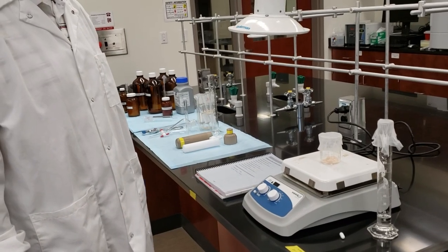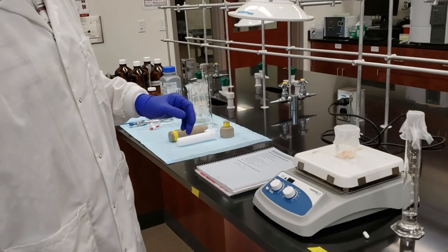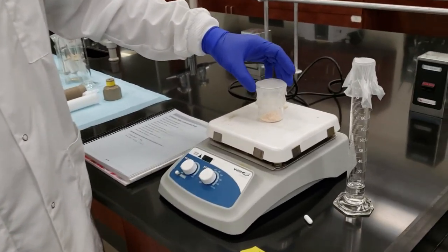CHEM 2212. This is the Williamson ether synthesis. So we're going to start out our reaction. First, we have to prep our basic solution.